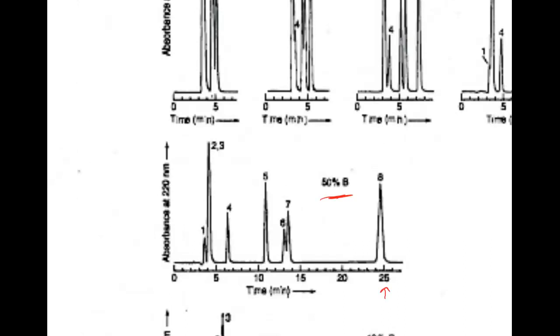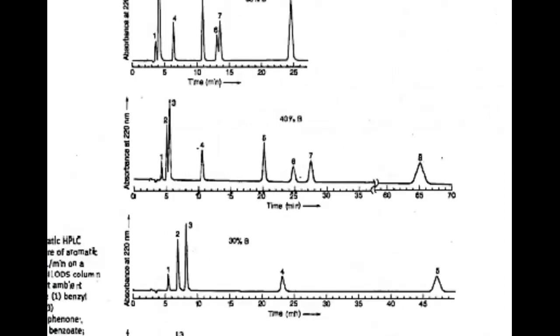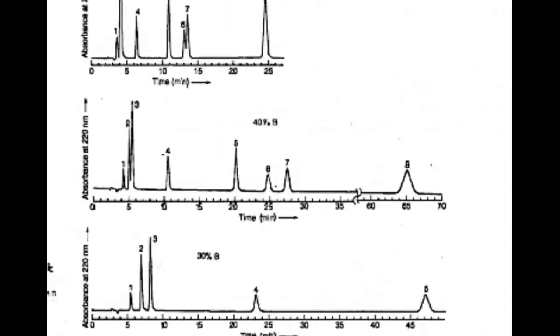Now it's almost costing us half an hour. But look, we're starting to see resolution between peaks 6 and 7 now. They're not fully resolved, but they're getting there. And we can even start to see a little bit of splitting here between peaks 2 and 3 at 50% B. So we're making progress. We're starting to achieve a better separation, again, at the expense of time. And again, if we keep reducing, here's 40%, here's 30%.